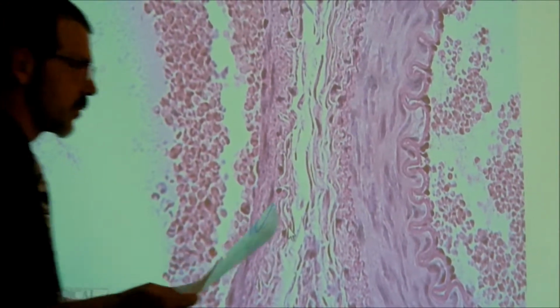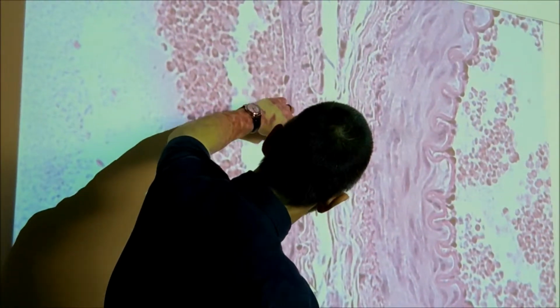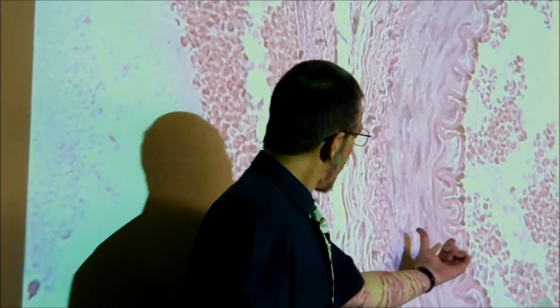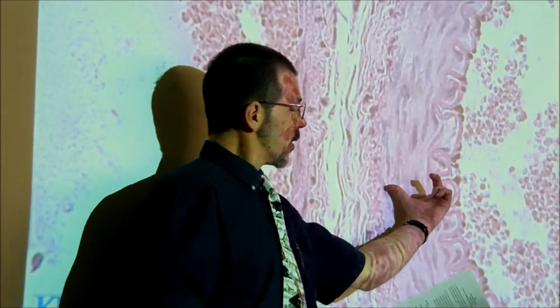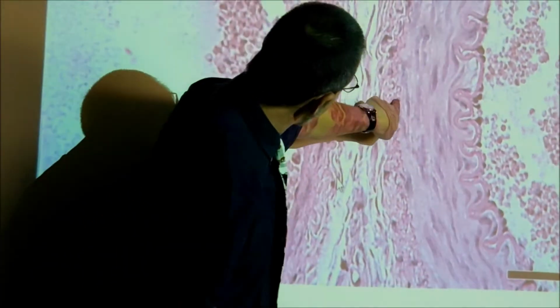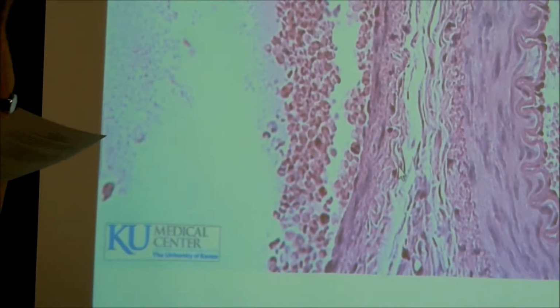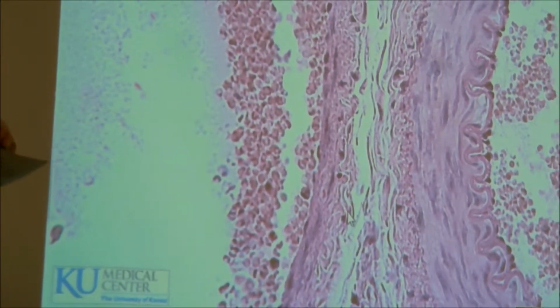Only in artery. Actually, these ones have it too. It's just it's right here. That's the intima there. So what do you call the layer from here to here? Media. Tunica media, meaning middle. So middle layer. Then what would you call from about here to about there? Externa, or also called the adventitia. So you have three layers. You have an interna, a media, and an externa. Literally inside, middle, and outside.